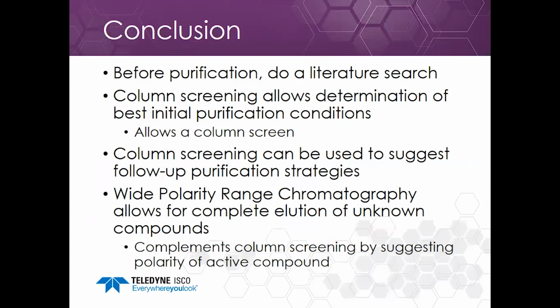So my conclusion is, before purification, do a literature search. Column screening allows determination of best initial purification conditions. After the column screen, I can then optimize the chromatography. Column screening can be used to suggest follow-up purification strategies.